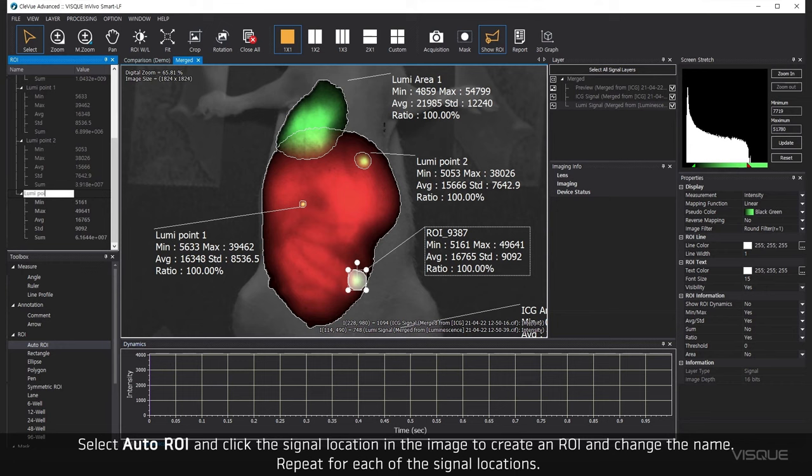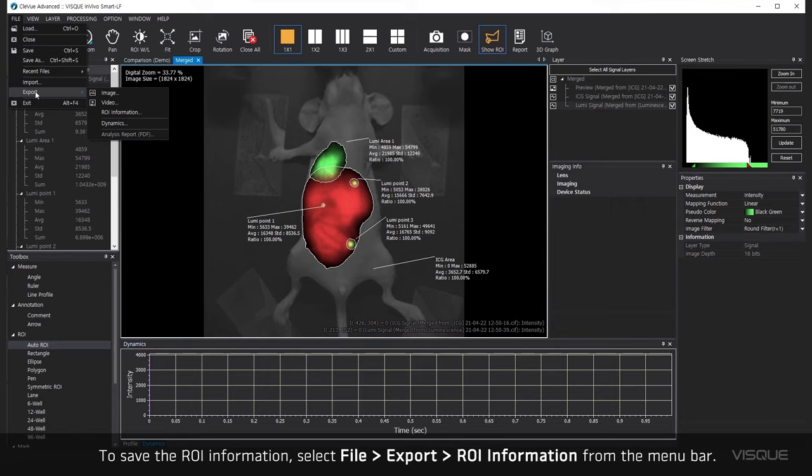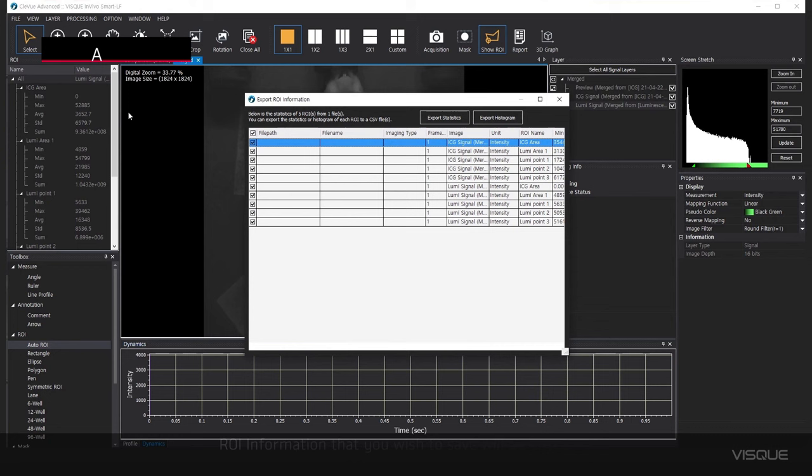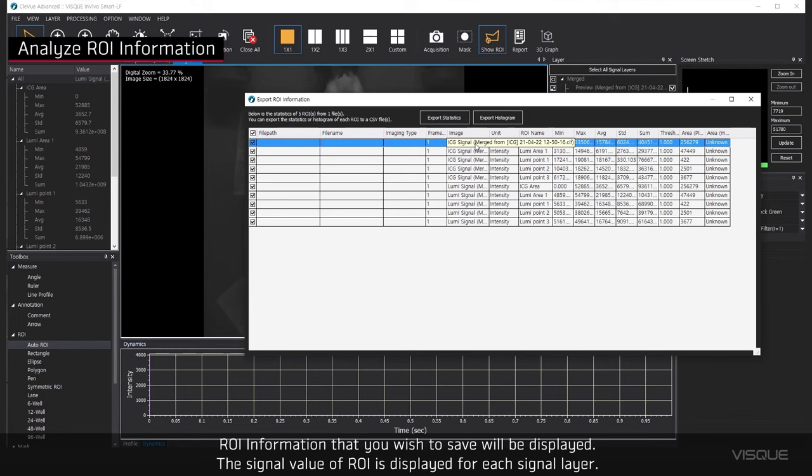To save the ROI information, select File Export ROI information from the menu bar. The ROI information that you wish to save will be displayed. The signal value of ROI is displayed for each signal layer.